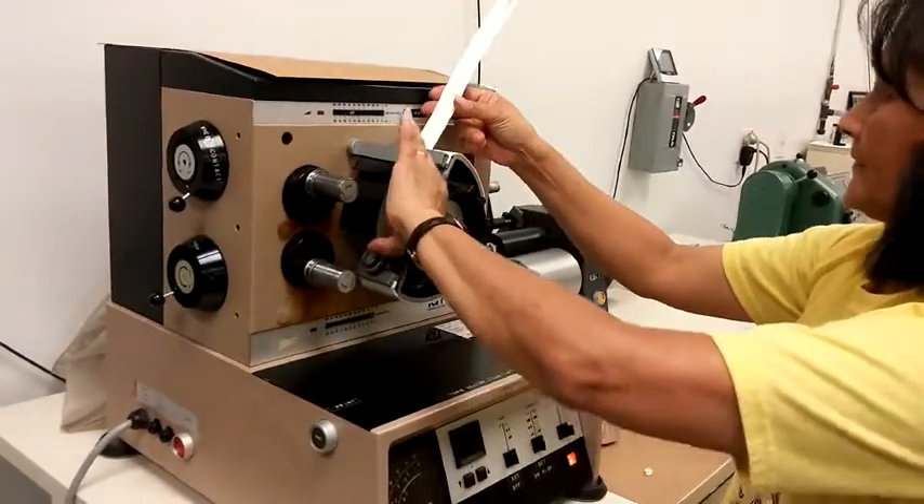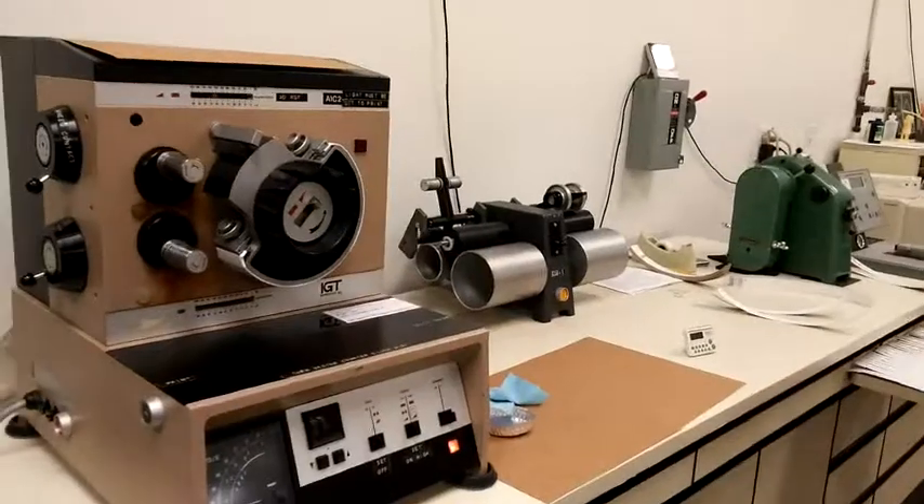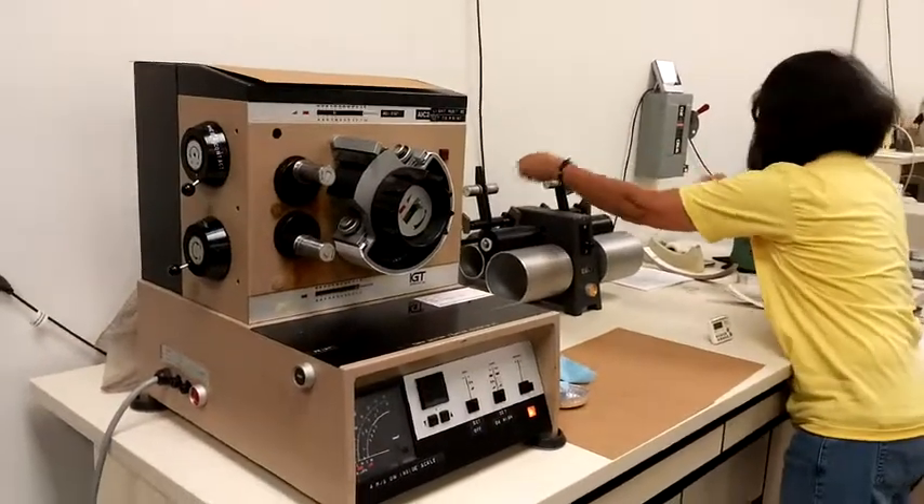The oil creates a pulling action on the paper surface, similar to offset ink on a printing press, resulting in picking, blistering, or both.